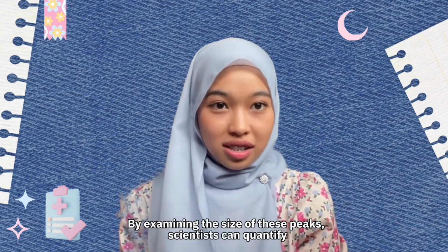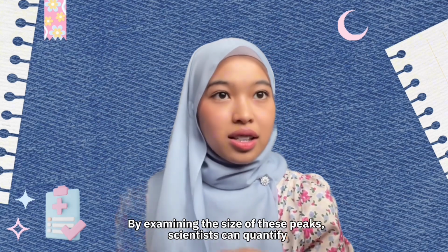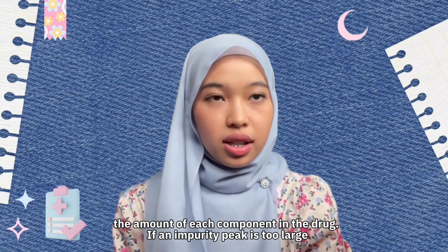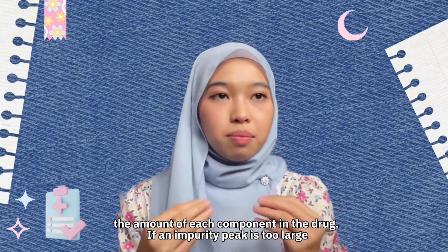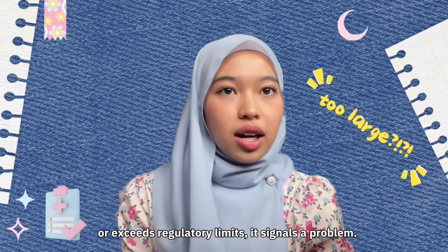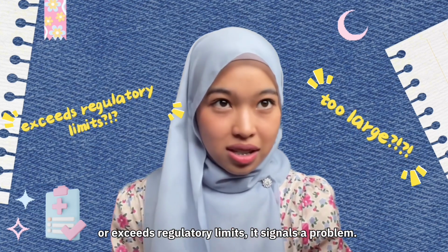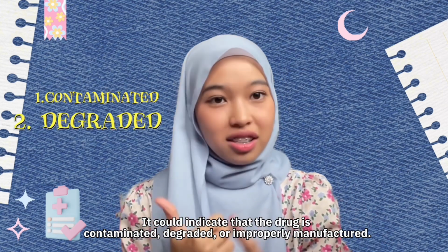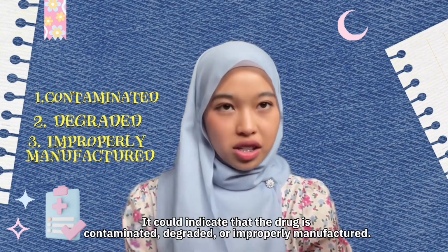By examining the size of these peaks, scientists can quantify the amount of each component in the drug. If an impurity peak is too large or exceeds regulatory limits, it signals a problem. It could indicate that the drug is contaminated, degraded, or improperly manufactured.